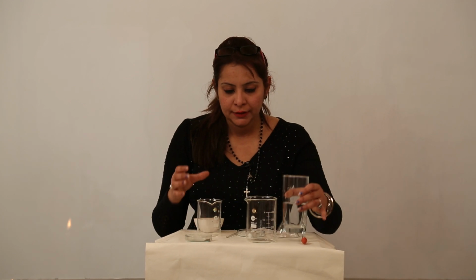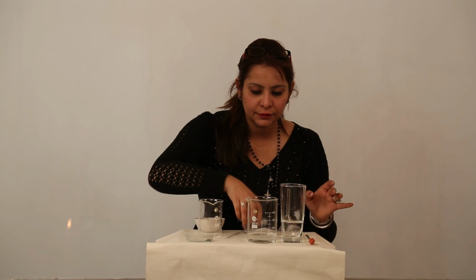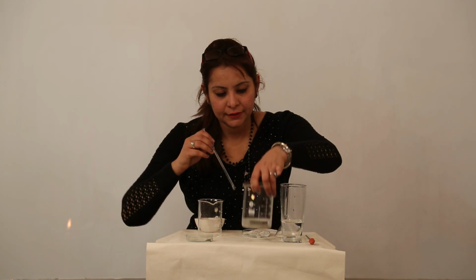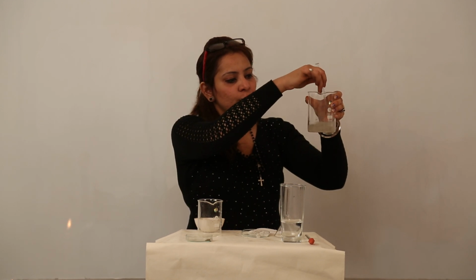Now I am going to use a particular solvent, and the solvent that I am going to use is water, because water is a universal solvent. So I am going to add water into a beaker, and I am going to add this sample into it. Now I am stirring it. This has salt as well as sand, a mixture of salt and sand. I am stirring it with the help of the stirrer.